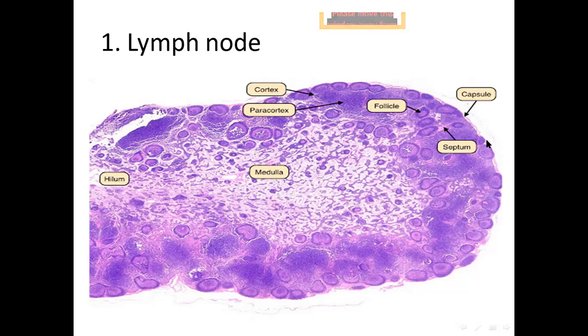So the afferent lymphatic vessels enter at the convex surface, while the efferent lymphatic vessels leave at the hilum of the concave surface. Also, the efferent lymphatic vessels have a valve in their internal lumen, to prevent regurgitation of the lymph back to the node.